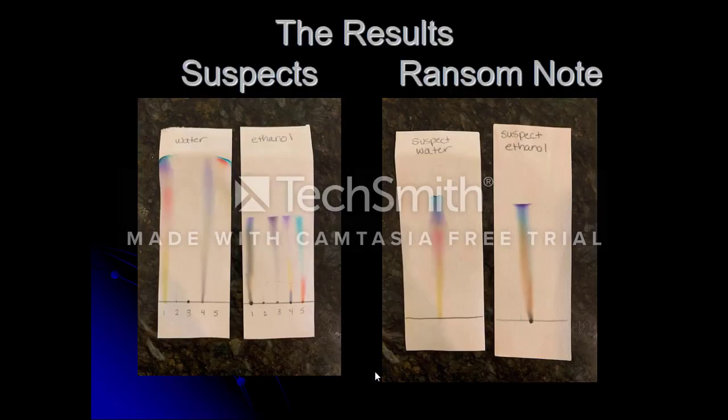All right, so here are the results. The strips on the left are the ones that you saw made in the video. So that's pens 1 through 5 in water on the left and in ethanol on the right in the left-hand picture. And then on the right, these are dots of the ink from the actual ransom note pen. So the suspect ink in the water and the suspect ink in the ethanol. And you're probably looking at that and trying to determine who actually committed the crime. So hold that thought, and we'll talk about it. You can come back and look at this, or you can look at it in the PowerPoint later.